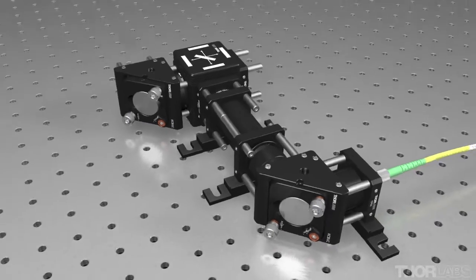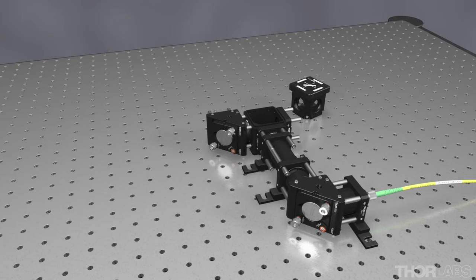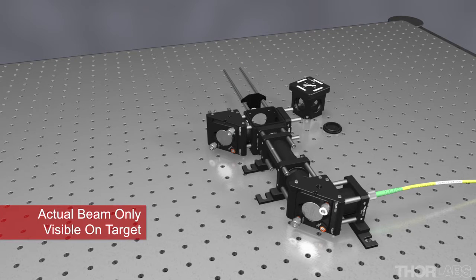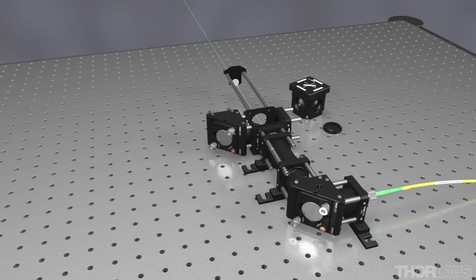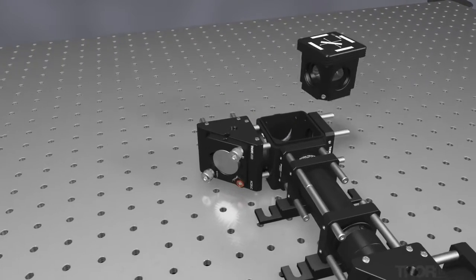To ensure that the beam is well collimated and centered through the expander, remove the filter cube and beam block from the far end of the module. Attach the long ER rods that came with the system to the rear of the filter cube holder. Move the target along the rods to follow the beam. It should be centered and maintain a relatively constant beam size. Replace the filter cube and the beam block.